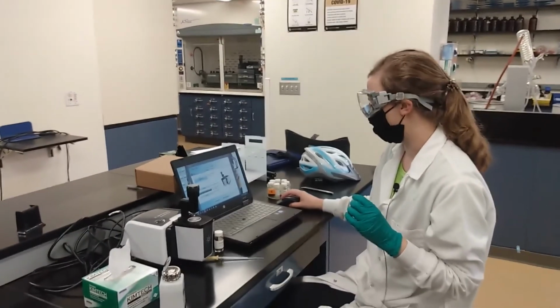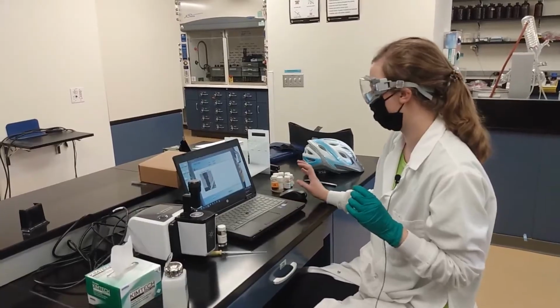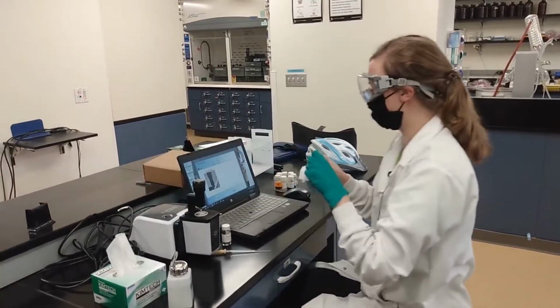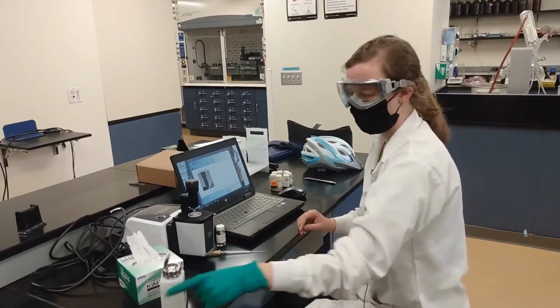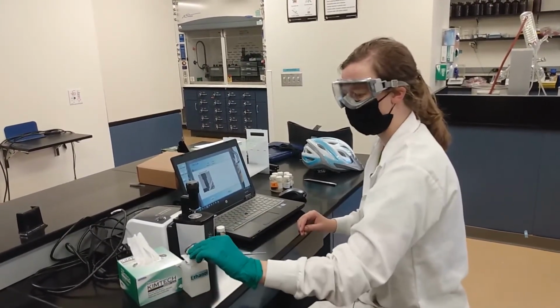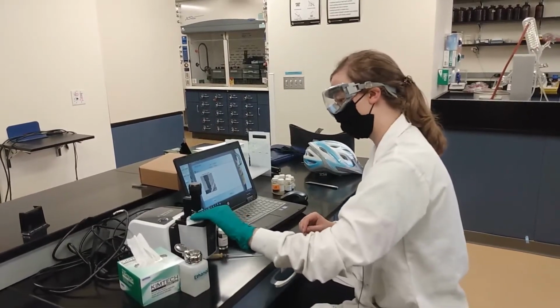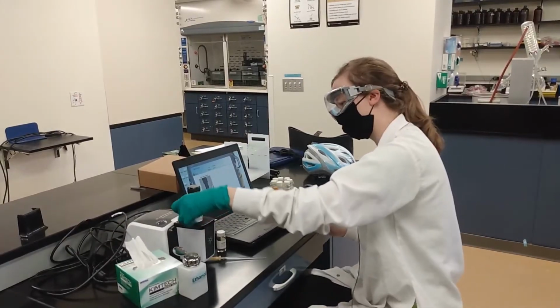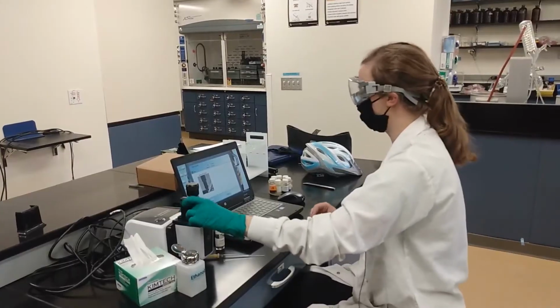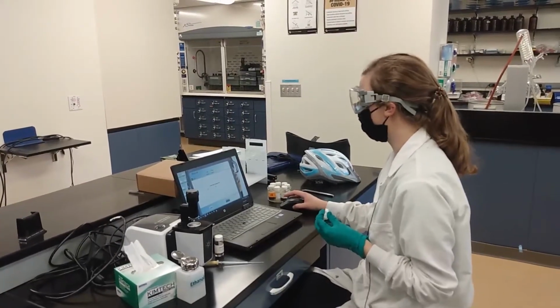Okay, so go to the computer. You're going to open up Microlab, which is like this little red circle here, and push start. It's going to instruct you how to run a sample step by step. So the first step is to clean the crystal. Take a little chem wipe, get one of these little bottles of ethanol, push down on the top, and clean off the crystal really, really well. Make sure that diamond's all clean, it's not discolored, there's no solid. And clean off the arm, just like that. And then we're going to go to next, and it's going to start collecting our background.